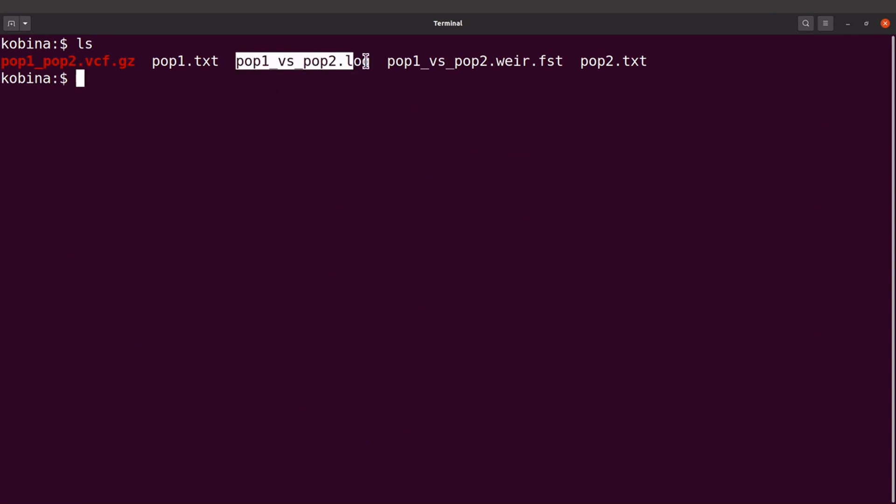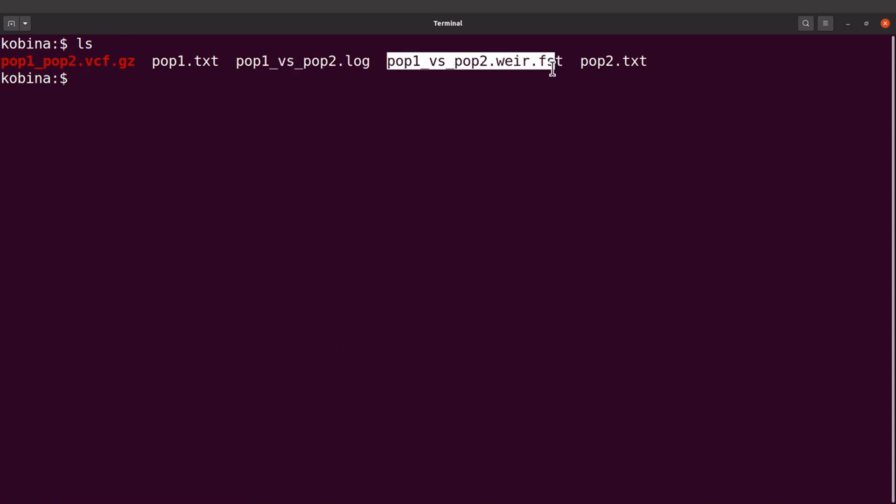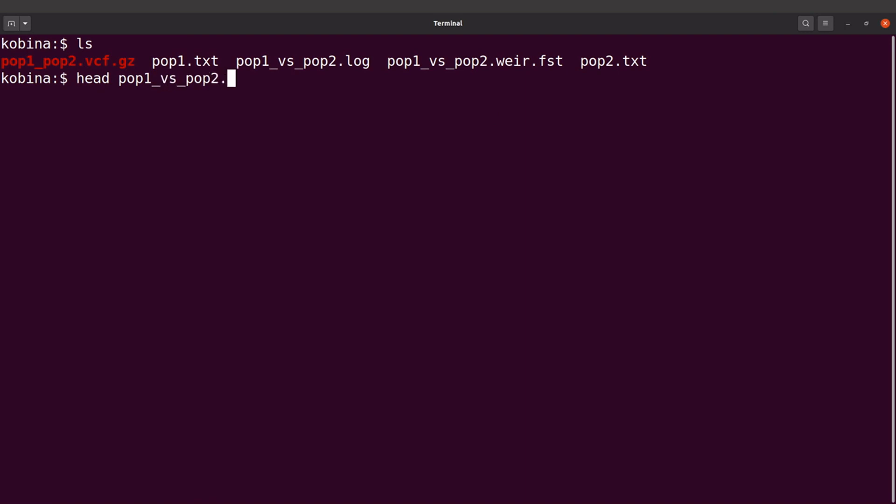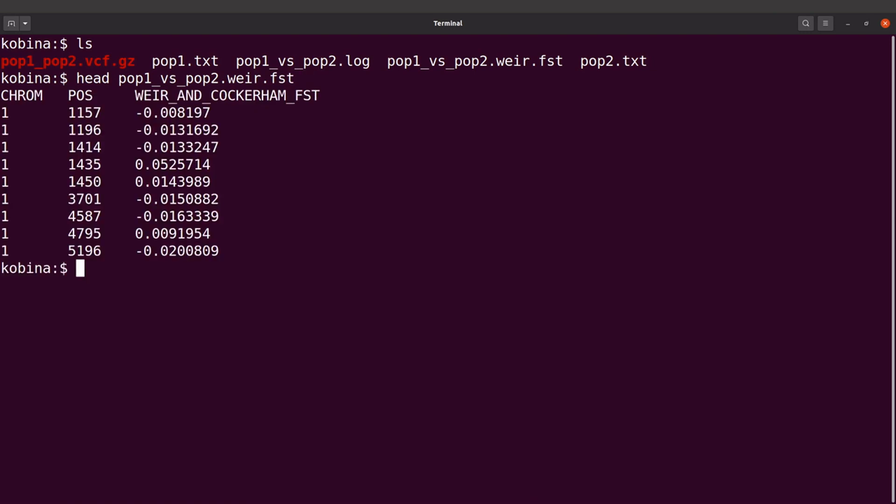So we have a log file here. We also have this one here. So this has the FST values. Okay, so let's do a head pop1 versus pop2.weir.fst. Okay, so we have everything here. So we have the chromosome number, we also have position, we also have the FST values here.